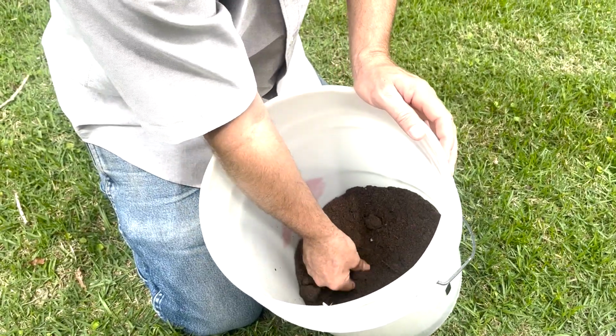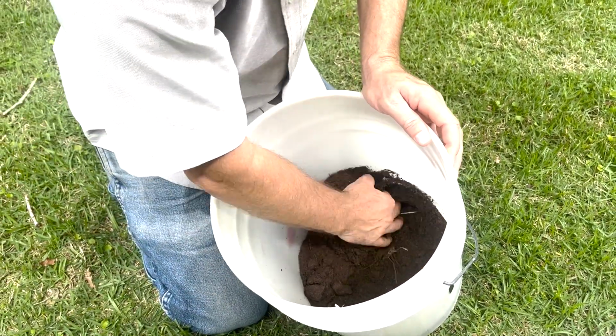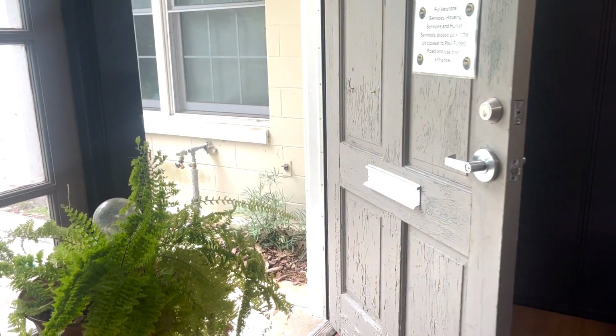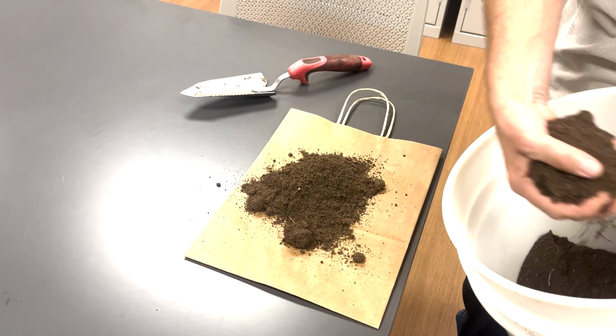Now thoroughly mix together the samples that are from the same areas of interest and remove any large pieces of debris such as roots and mulch. Take your samples inside and spread them out on an area such as a paper bag to allow them to air dry.